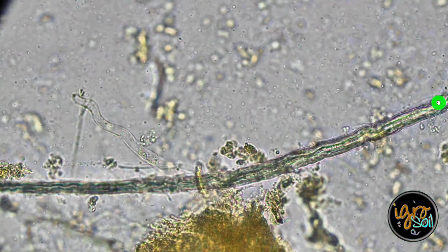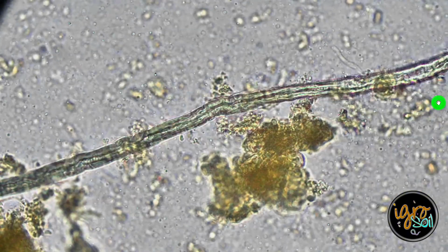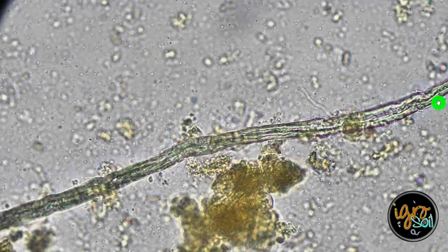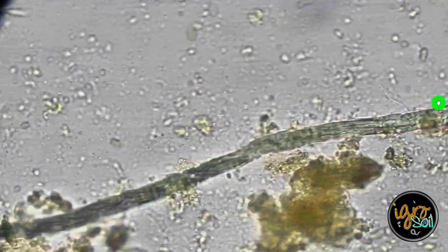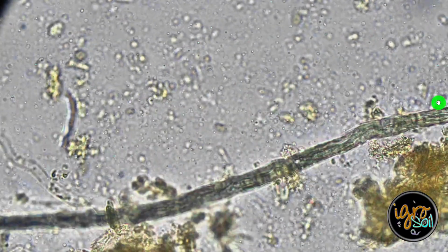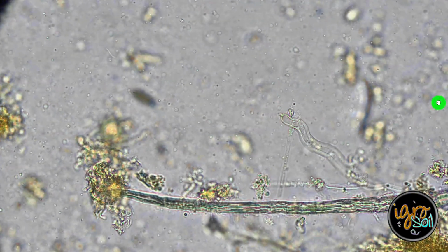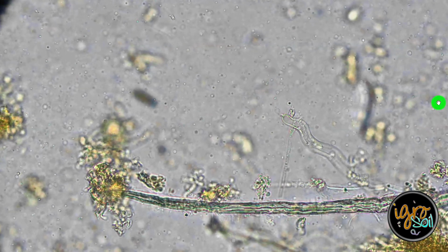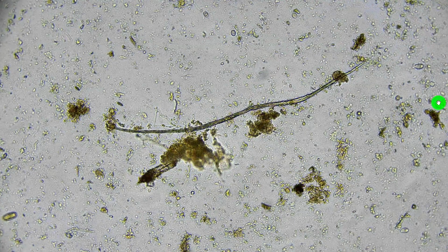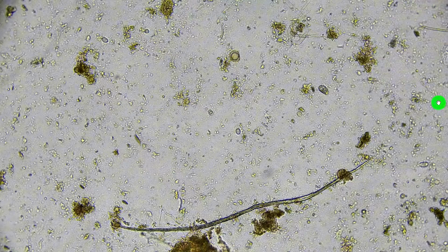So the next thing I do now is I'm trying to look inside of it for bacteria to see if it's alive, see if it's eating bacteria. It could be, I have no idea. It could be a microplastic that doesn't light up. I don't know. It's not clear enough. It's too dense. I can't answer that, so I'm not gonna worry about it. If I had to make a call though, I'm gonna call it plastic. Call it what it is.